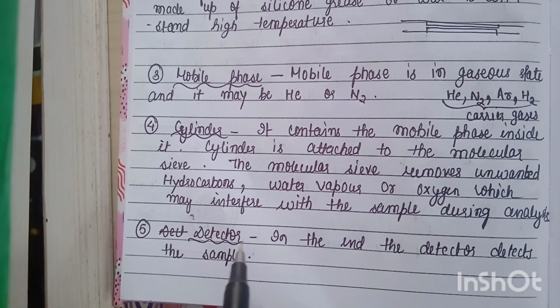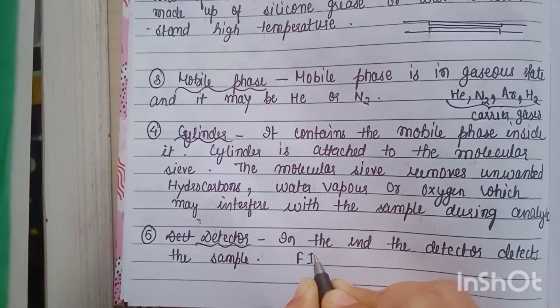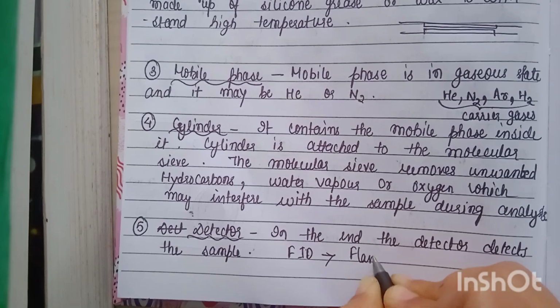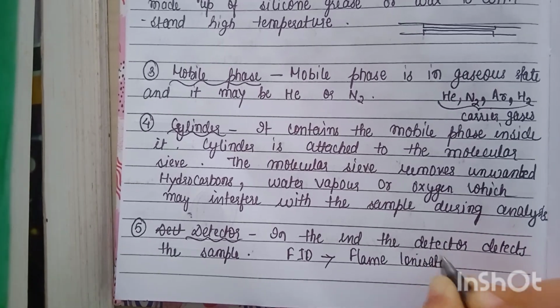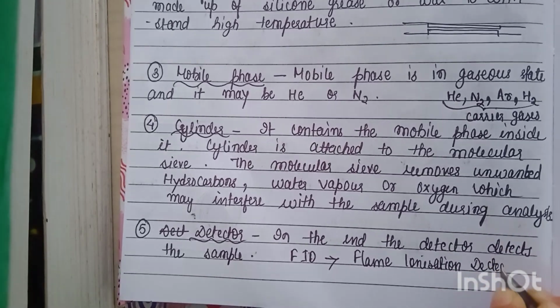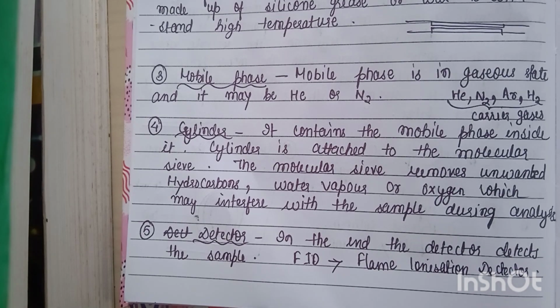The fifth component is the detector. In the end, the detector detects the sample. For example, a FID detector, that is a flame ionization detector. I will make a separate video on the types of detector.